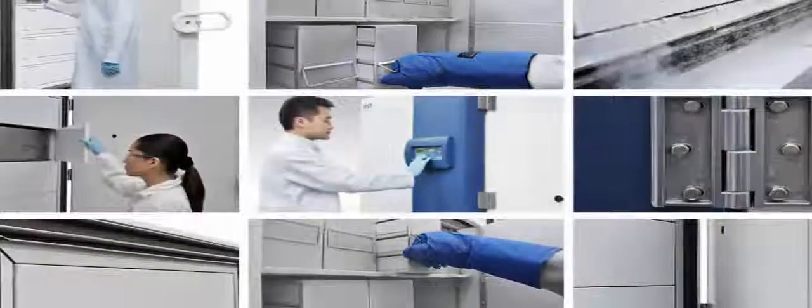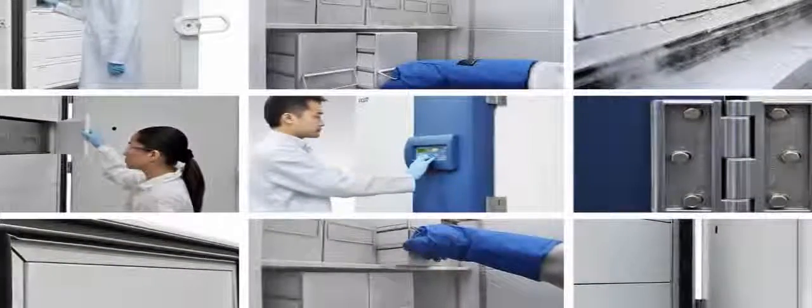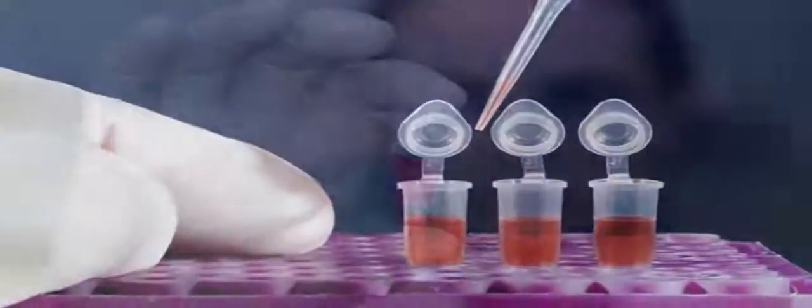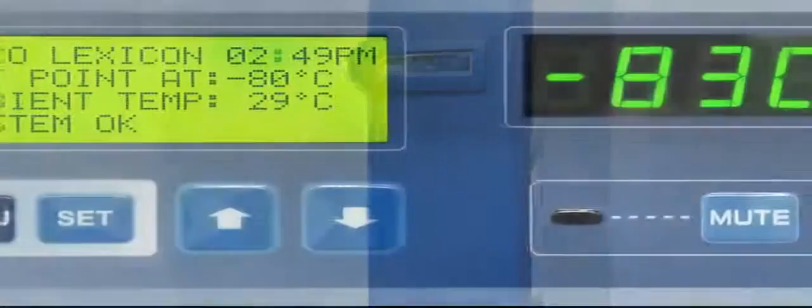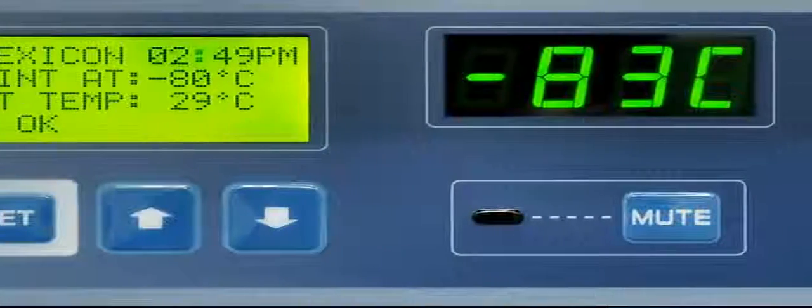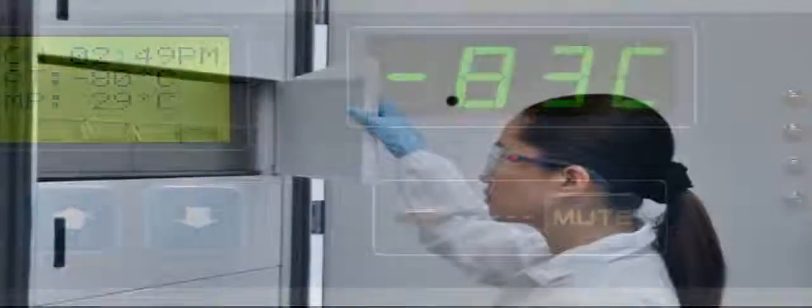ULT temperature freezers are widely used in scientific research for long-term storage of temperature sensitive biological samples, such as red cell samples and blood plasma. As ULT freezers are often operated at minus 80 degrees Celsius continuously for years, reliability is of paramount importance to researchers.